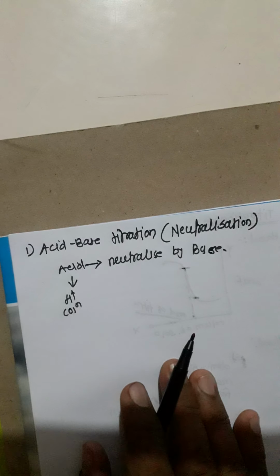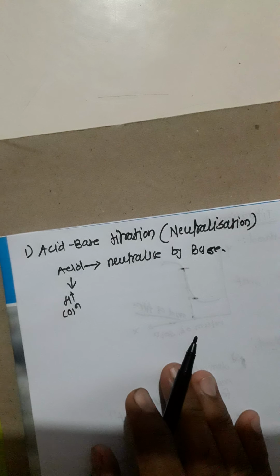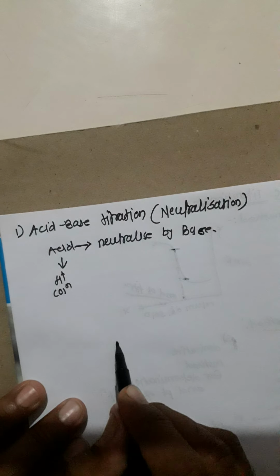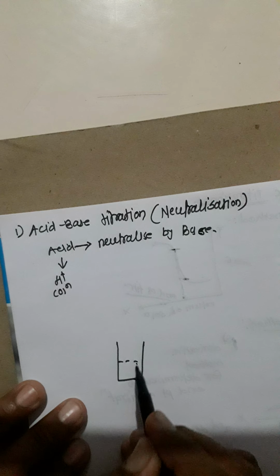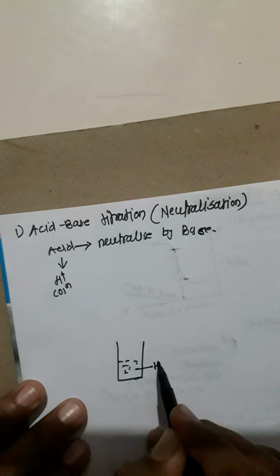In this titration, experimentally, take a beaker. In this beaker, use the HCl solution.